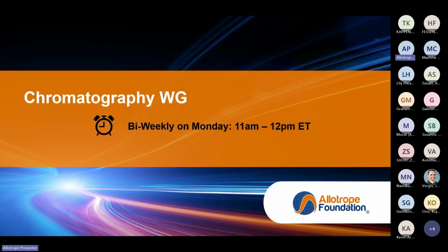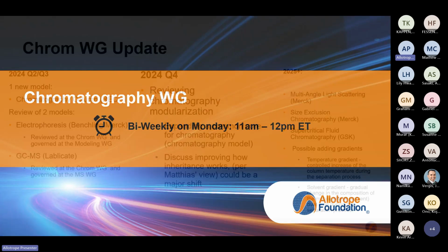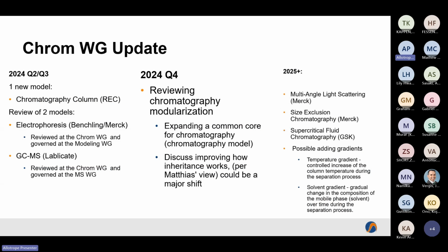So for the chromatography working group, again, every 2 weeks on a Monday, just say if you want to join. We've been working on the chromatography column model. That's in conjunction particularly with Dwight Stoll from Gustavus Adolphus College. For those who know chromatography, you're probably aware of the HPLC columns website, the database that lets you compare column equivalents using the hydrophobic subtraction model.